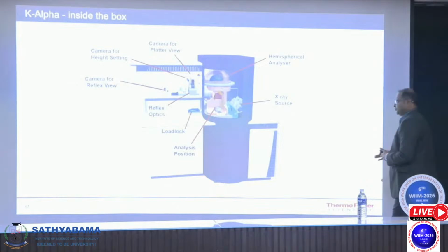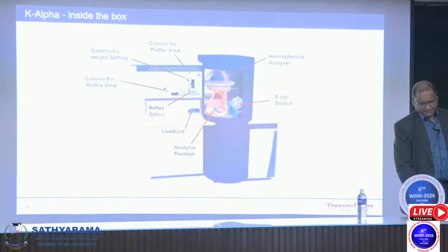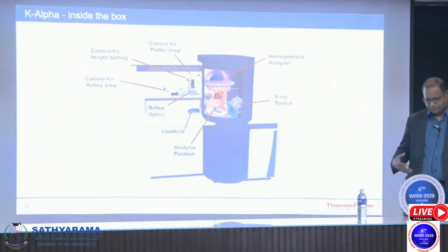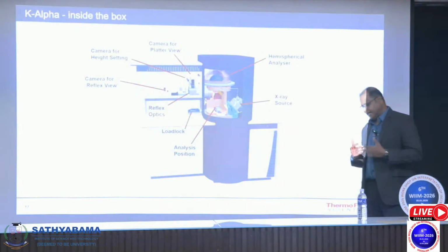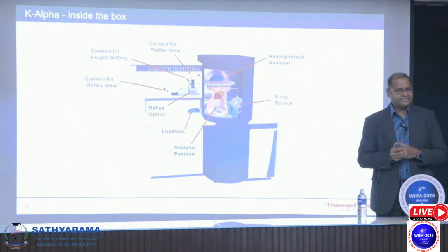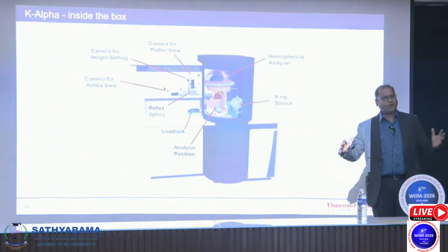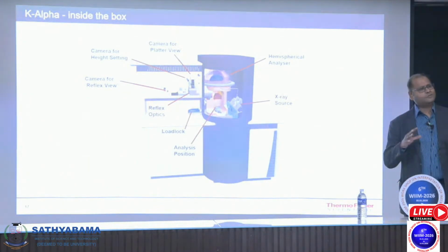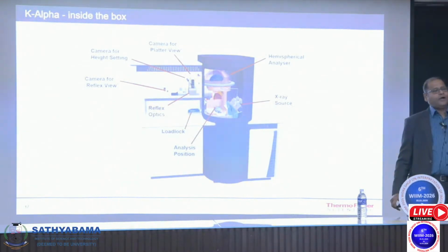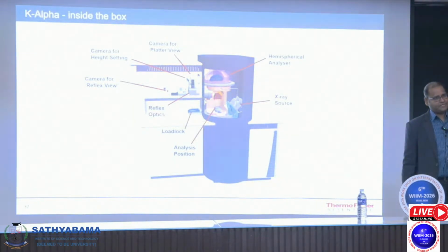A quick view of some of the important components you will be looking at through the demo: this instrument is so compact. The reason why I say this is that if any of the senior users have used XPS in the past, or have visited a surface analysis lab, in the days when I did my research, when I used to go for a surface analysis experiment, the instrument used to be as big as this hall, from this end to this end, one single instrument. And it used to have multiple operators taking care of a single instrument. It was so complicated. And to get one data set, you had to wait for weeks, or sometimes even 10 to 15 days. That was the complication involved with XPS instrumentation.